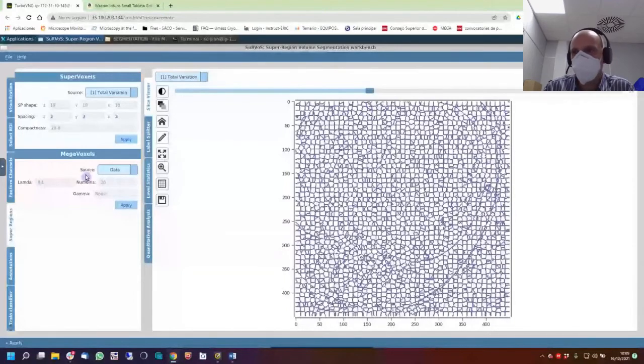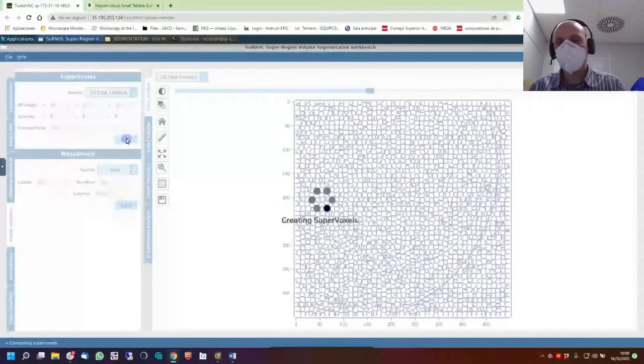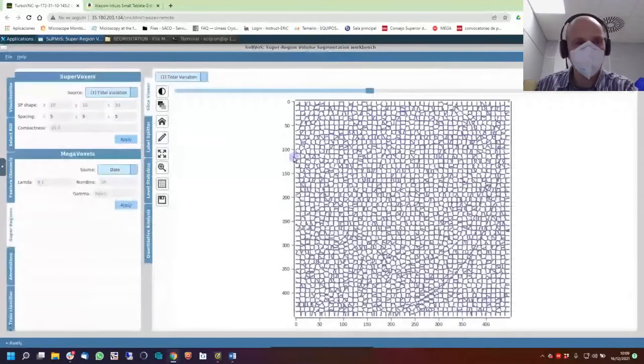So it's up to you, but for this course, I recommend going for bigger ones, because we are not worried now about being accurate. Yes, I wanted to show you tips and tricks. So go for a bigger one to make our life as easy as possible for a moment.